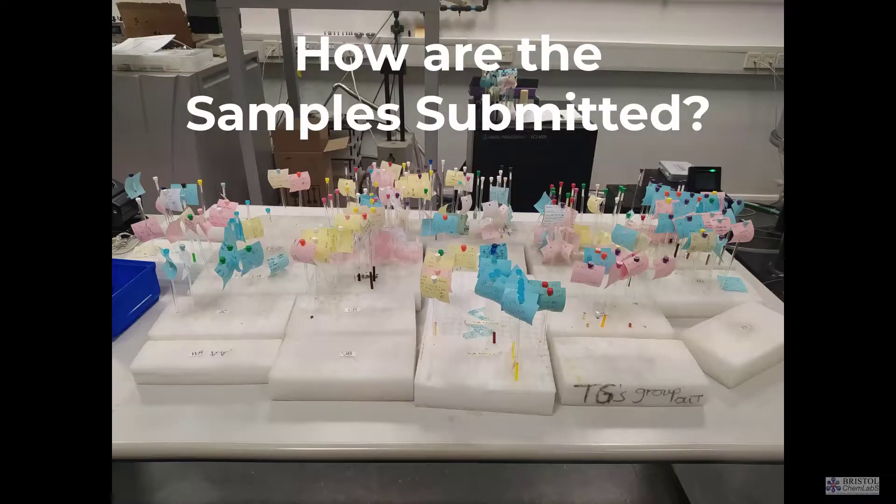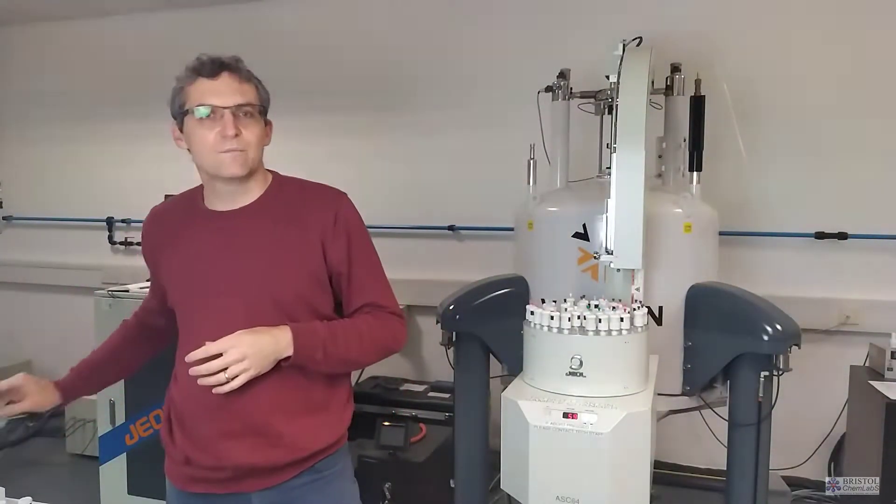What I'm going to do now is just talk about how that works, what an NMR spectrometer is, and the kind of information that it can get you. One of our chemists would prepare an NMR sample, it looks something like this.